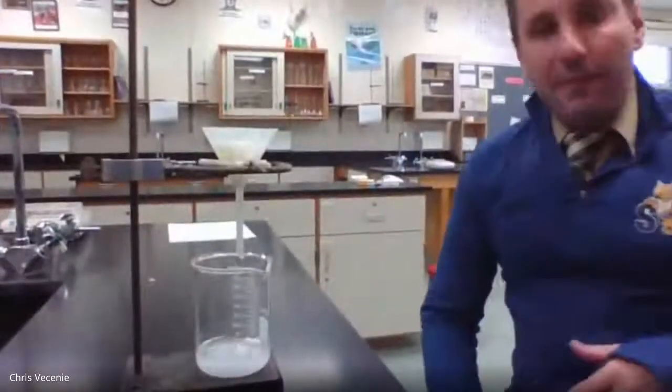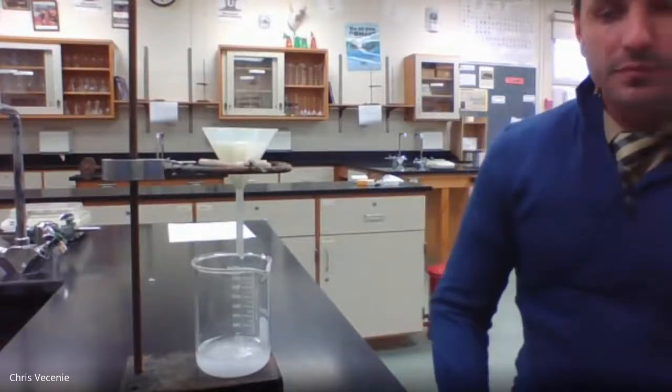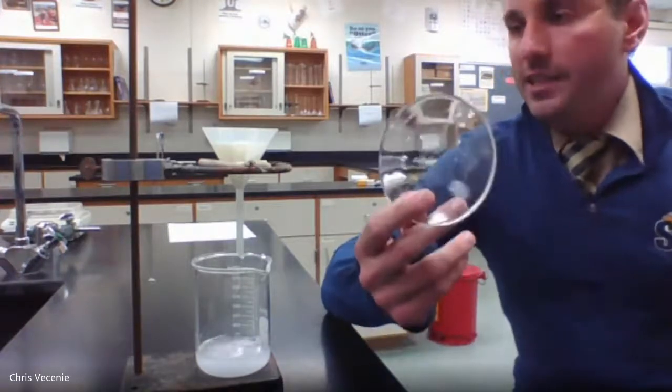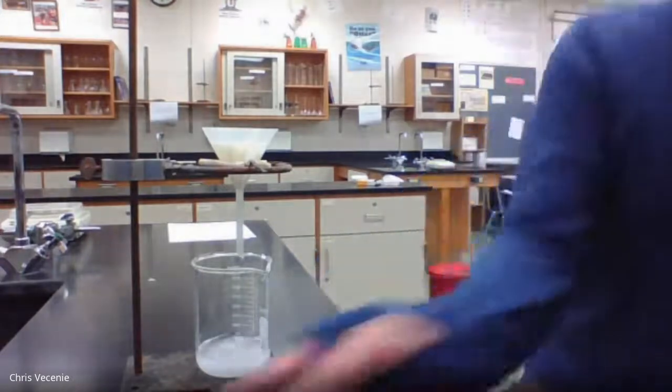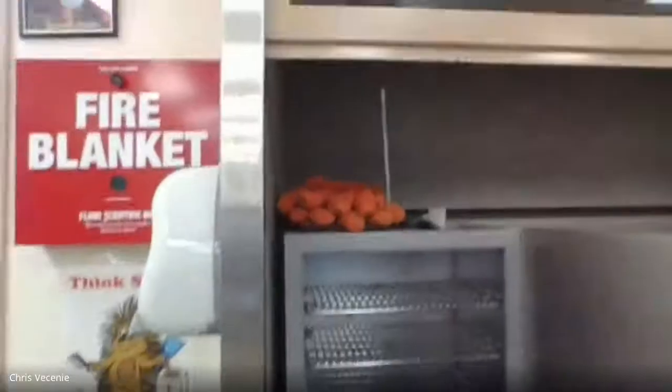All right, so we're going to let that filter for a second, and then I'm going to show you where we're going next. What you do is you go in your drawer, and you're going to get out a glass plate. That glass plate is going to get the filter paper, and we're going to open it up onto the glass plate because we are going to take it to the back. And when I take it to the back, I'm going to put it in the oven in the back. So we have the oven back here that you guys can see. I open the door, and there are shelves, and this guy's on. And what will happen is we'll have to put him in there for something like 5 or 10 minutes.